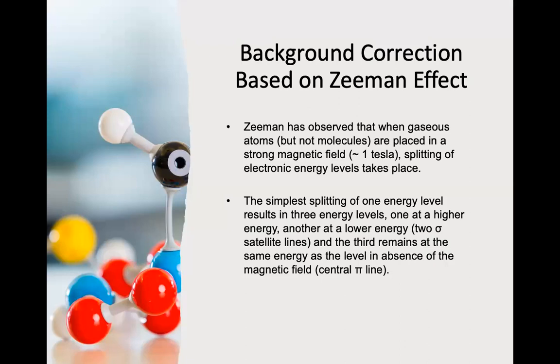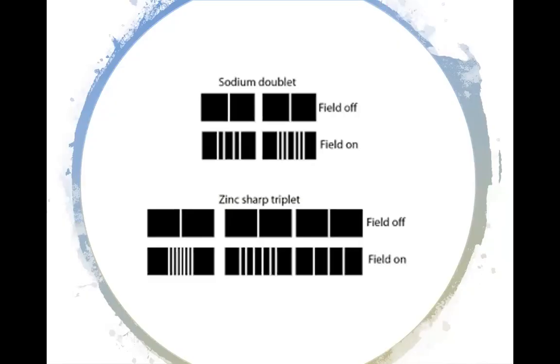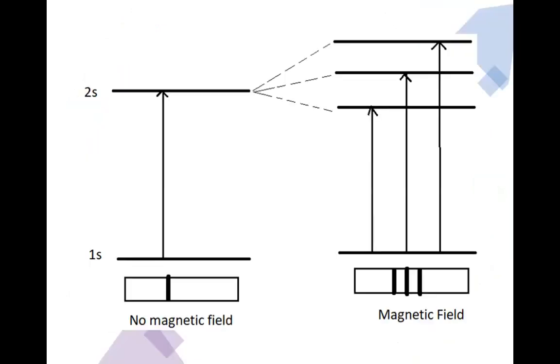So this is, okay, it's actually the Zeeman effect. What happened is this is the excitation of the electron, and of course the electron will go down and you observe an emission line. Okay, emission spectrum. This is under no magnetic field introduced to the system.